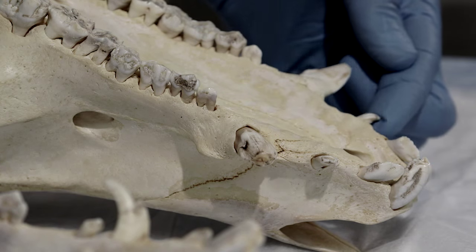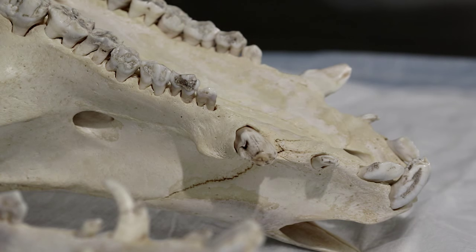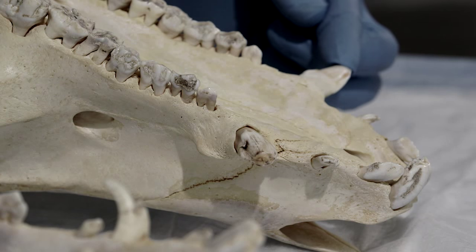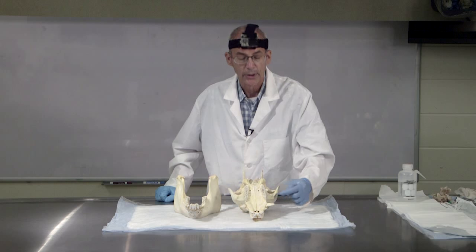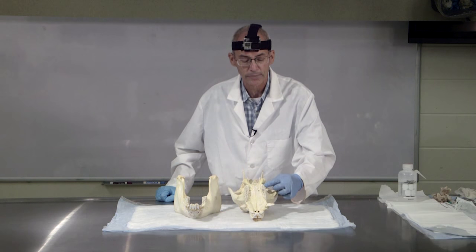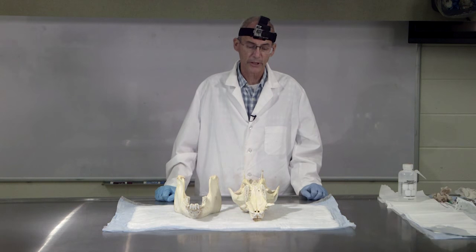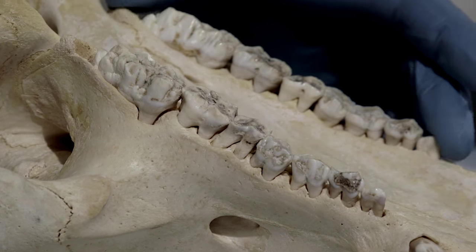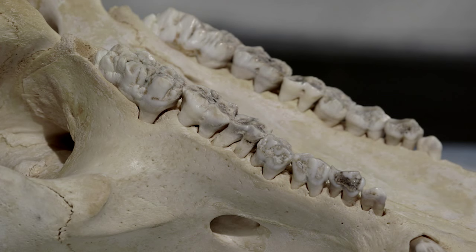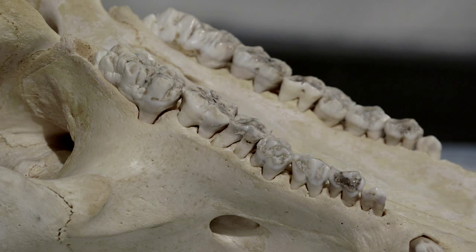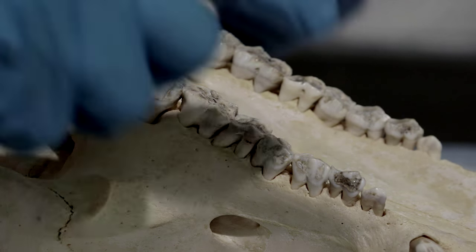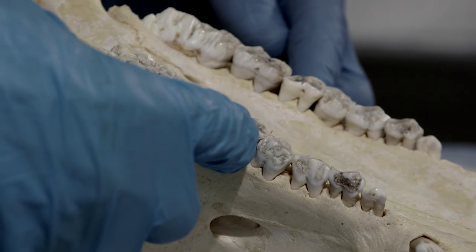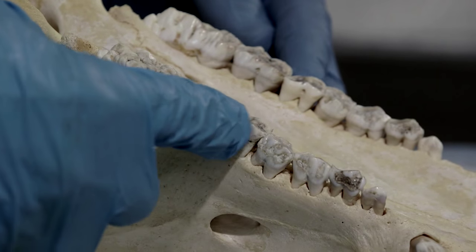This is the typical ancestral count seen in mammals — three incisors and a single canine, as seen in primitive fossil mammals. The next type of teeth are premolars, and then the last type are molars. The pig has four premolars on each side and then three molars. These teeth are involved in processing food — in the pig, a grinding function to help grind food down. In something like a dog or cat, they have a scissor-like function to shear food into smaller pieces. So the pig has four premolars — one, two, three, four — and three molars.